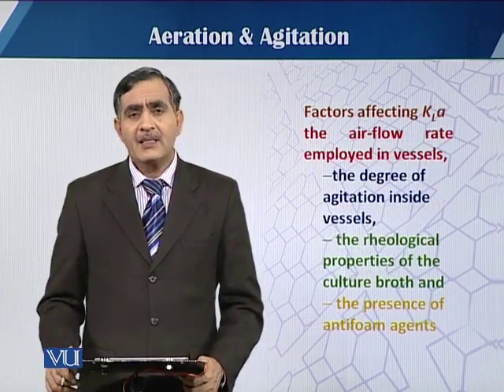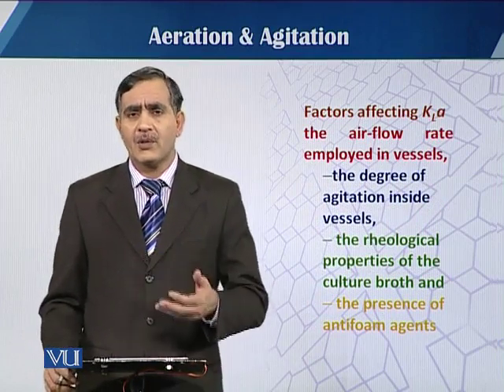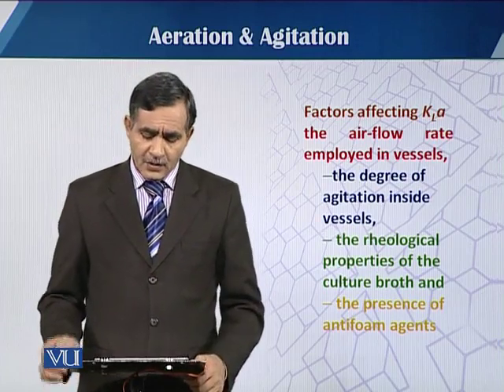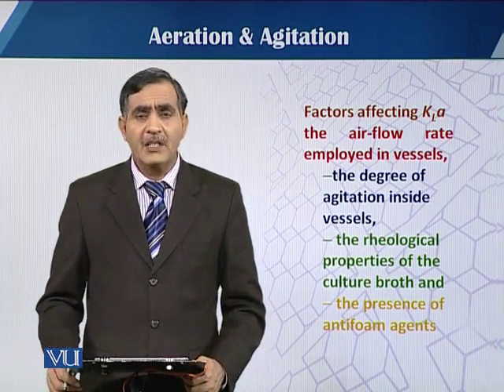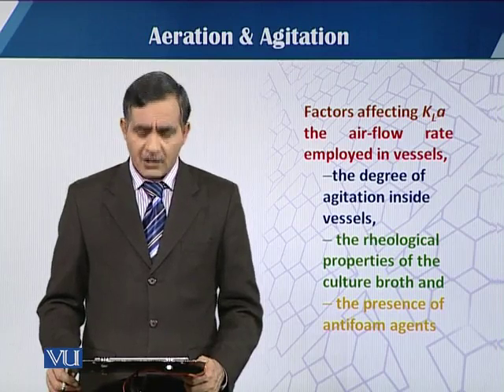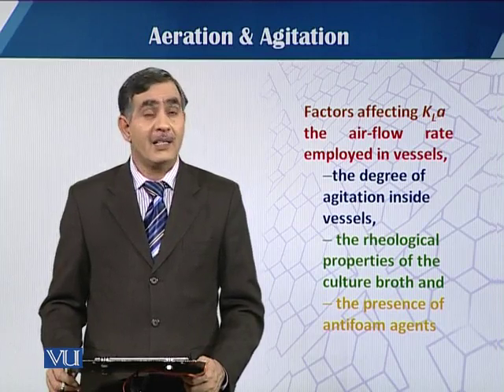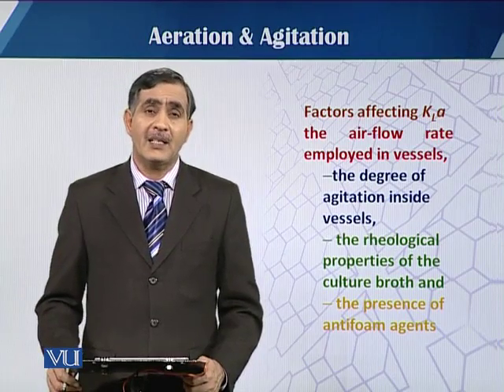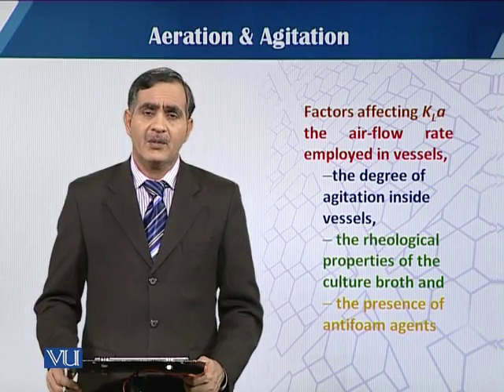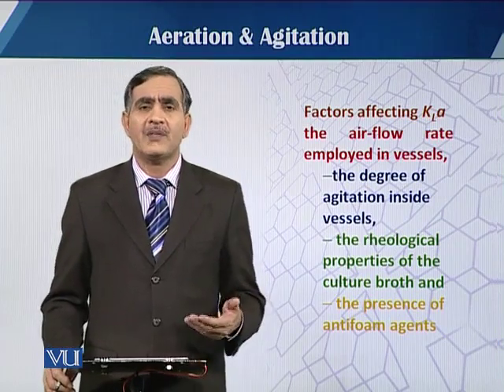As far as the KLa, the volumetric mass transfer coefficient, is concerned, a number of factors affect KLa. You can see here that three major factors are involved: the degree of agitation, the rheological properties of the culture broth, and the presence of antifoam agent, because antifoam agents have an adverse effect on oxygen solubility. So these are the different factors that affect the estimation of KLa.